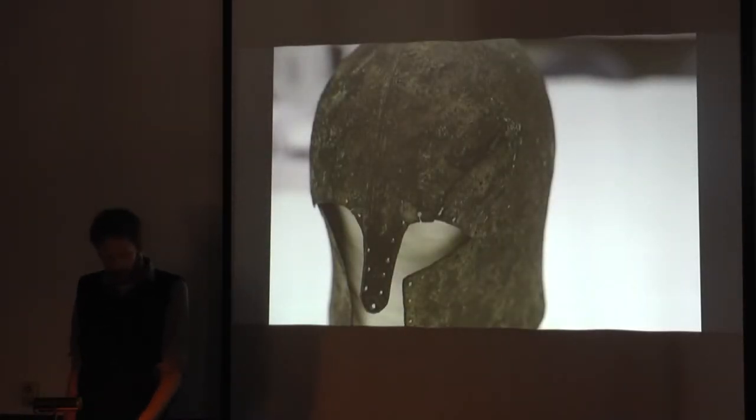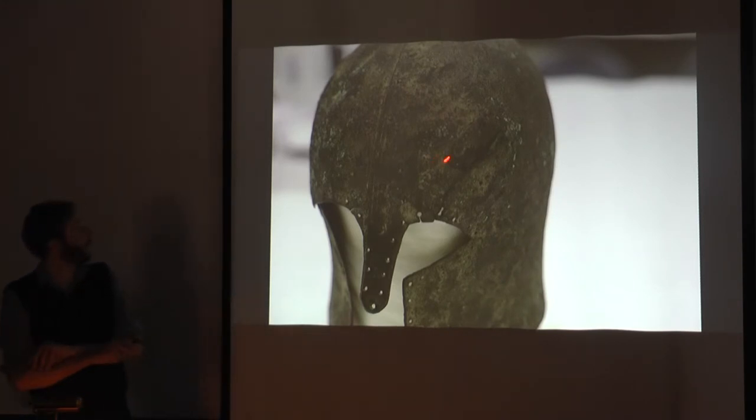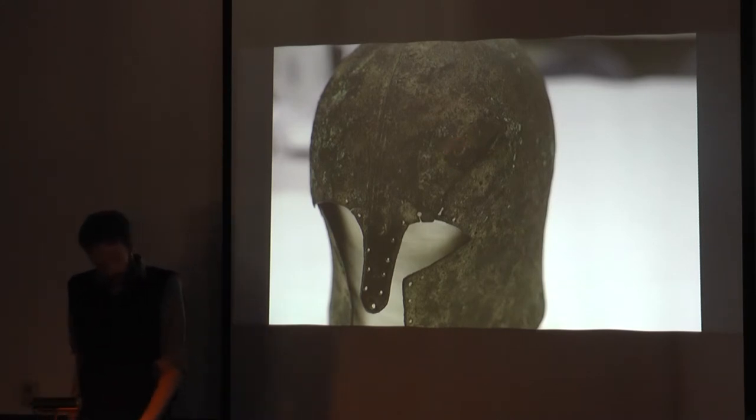Second, the rivets, both on the patch and in the seam, are less thoroughly cleaned than the body of the helmet itself. And actually, in this, you can see the cuprite covering half of the patch there that I was talking about earlier. The original conservators took care to define the rivets, but they did not remove much of the cuprite. We therefore should expect the device to read much higher levels of copper and lower levels of everything else. The photons from the pXRF spectrometer had to go through the entirety of the cuprite layer before they could fluoresce any of the tin atoms below.